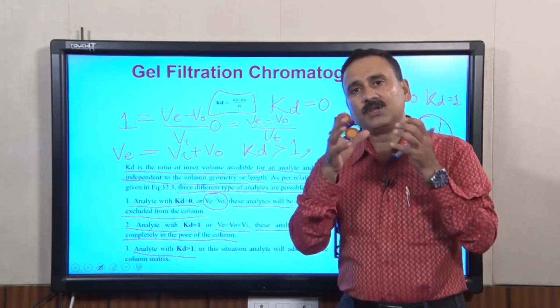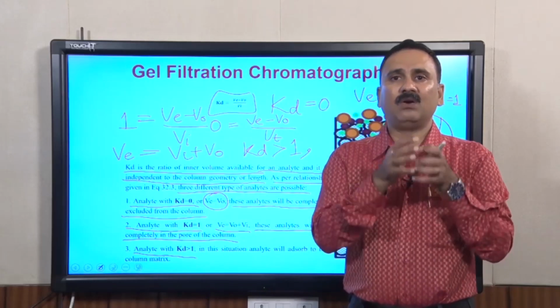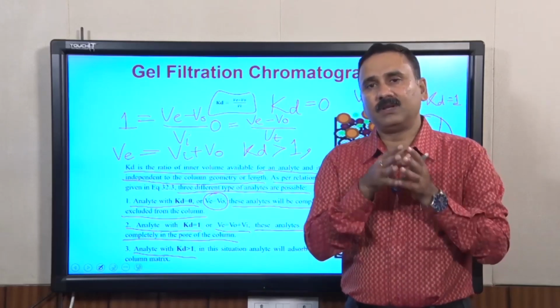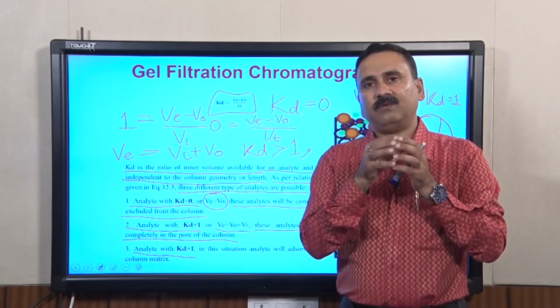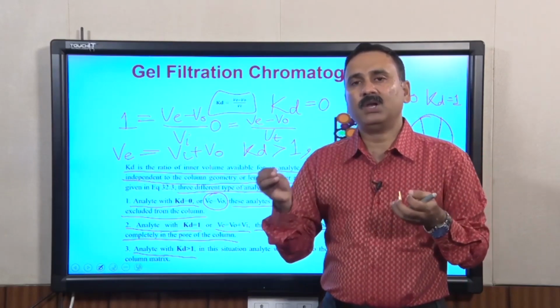So, that is why most of the beads that people use in gel filtration do not have any kind of affinity or any kind of preferences or any kind of association with the molecules.